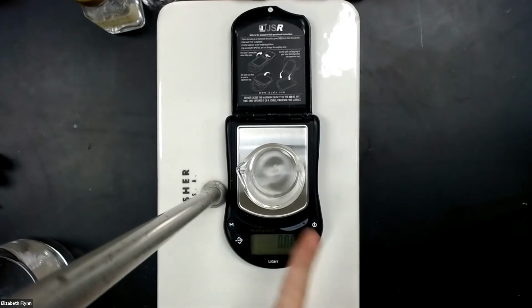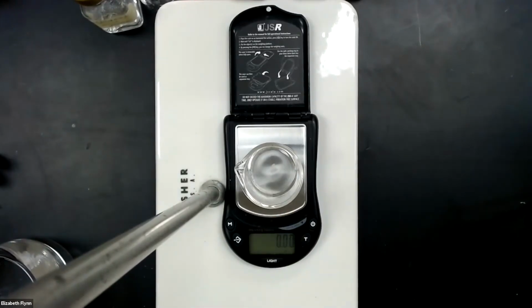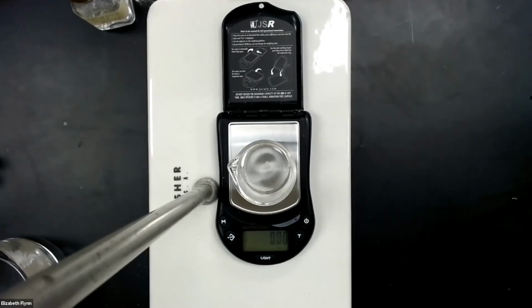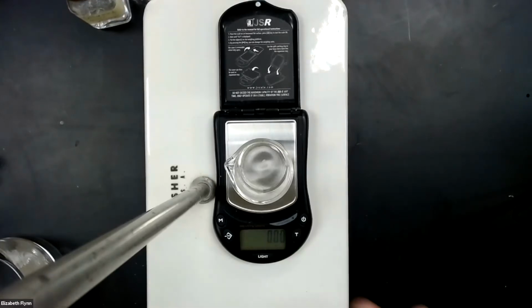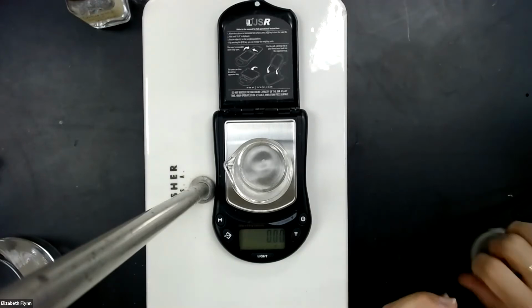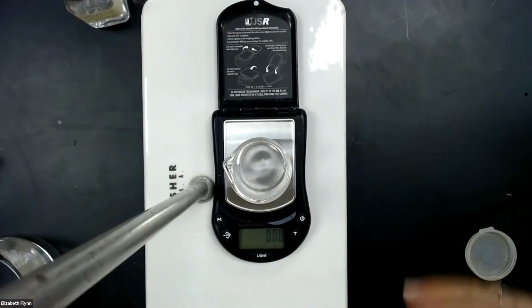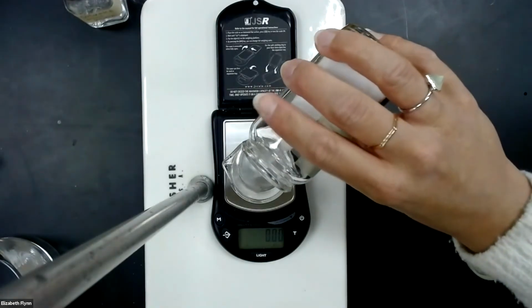And now the mass of the beaker is already accounted for, it's subtracted from the mass of the salt already. So this time we don't have to do any subtraction when we're making our saline solution. We can just add the sodium chloride right to the beaker. Okay, so I've got my table salt zeroed out.